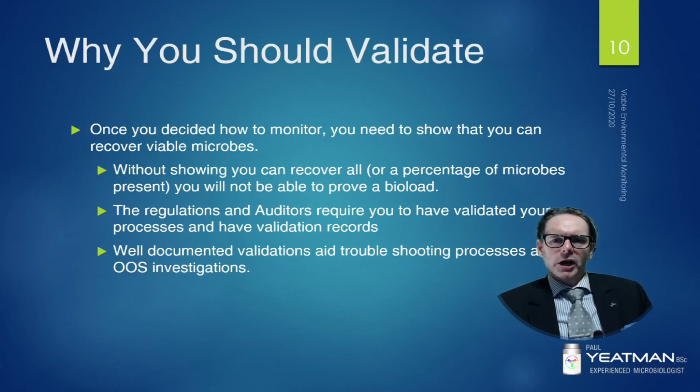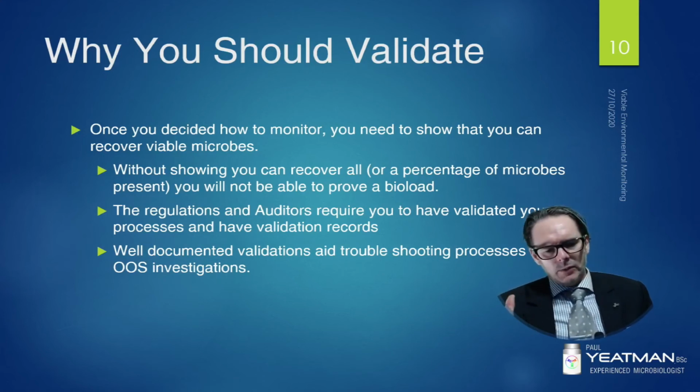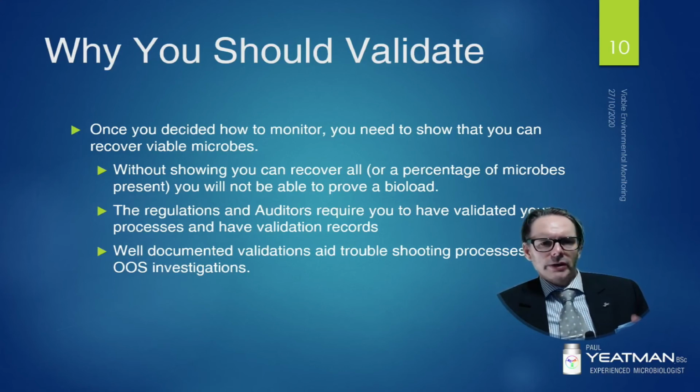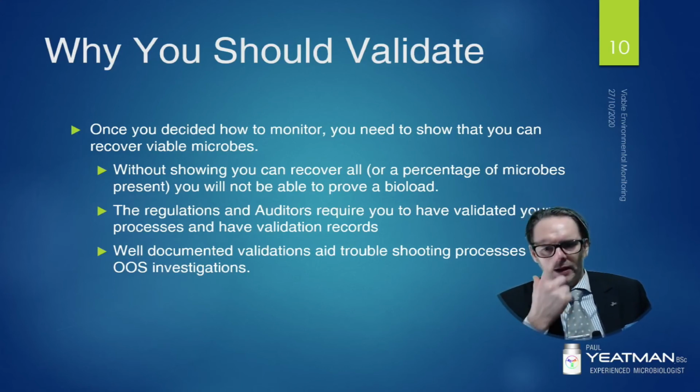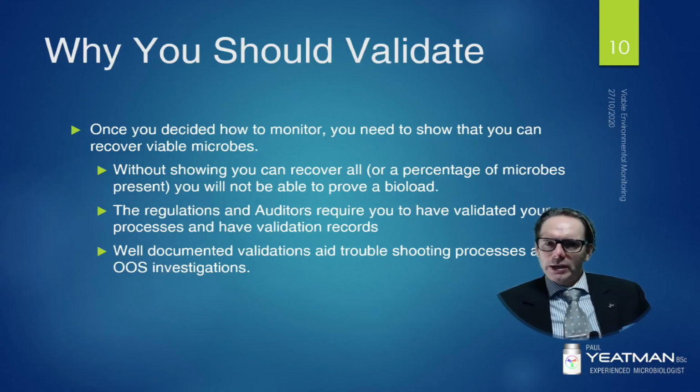Validation might show that 90% of the microbes on a surface can be recovered. So with my 1 CFU and a 90% recovery rate, there's most likely you've picked up all of them there. If you had 10 CFU or colony forming units, you might recover 9. So it gives you some confidence that with the validation, the microbes you recover are pretty much all the microbes there. If it was, say, 50-50, that's when you would change your limits to accommodate whatever the regs require.